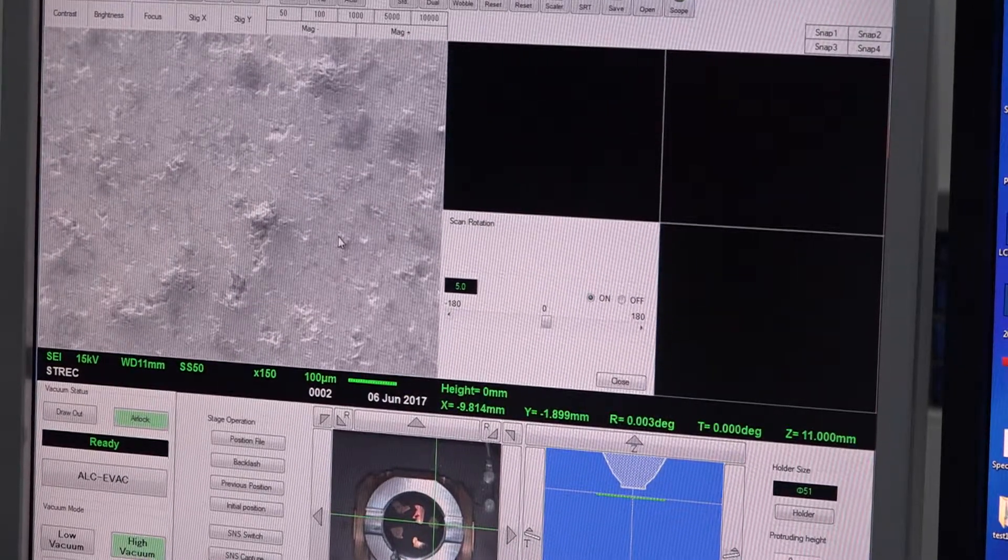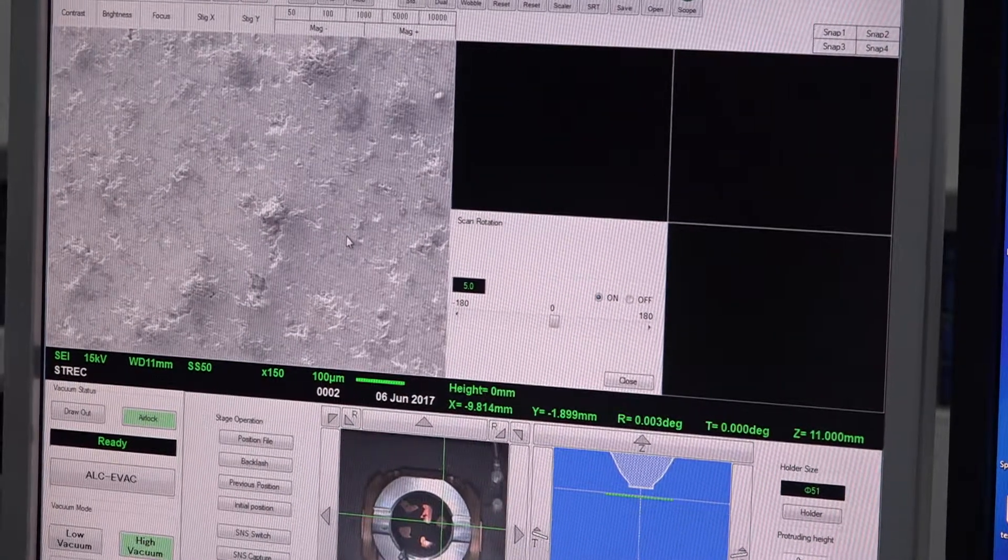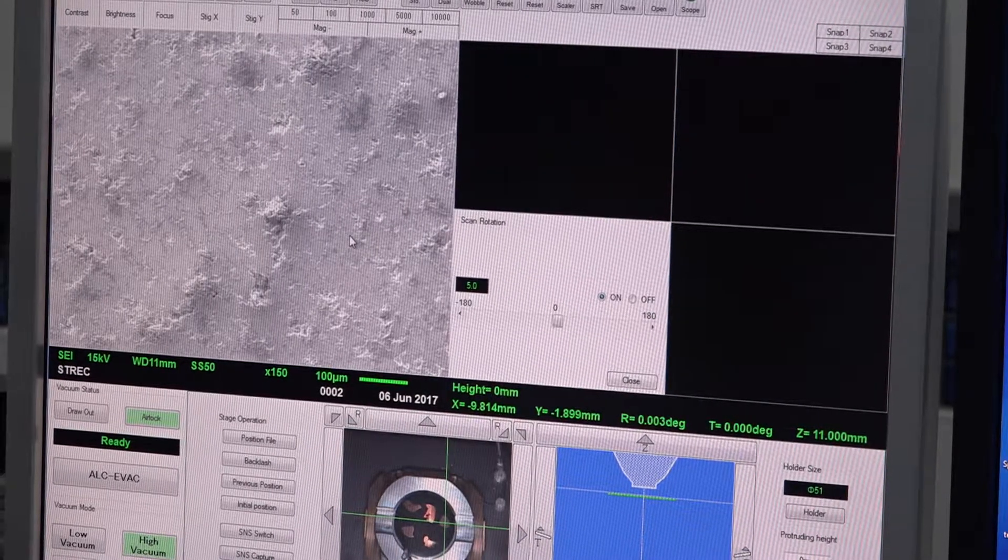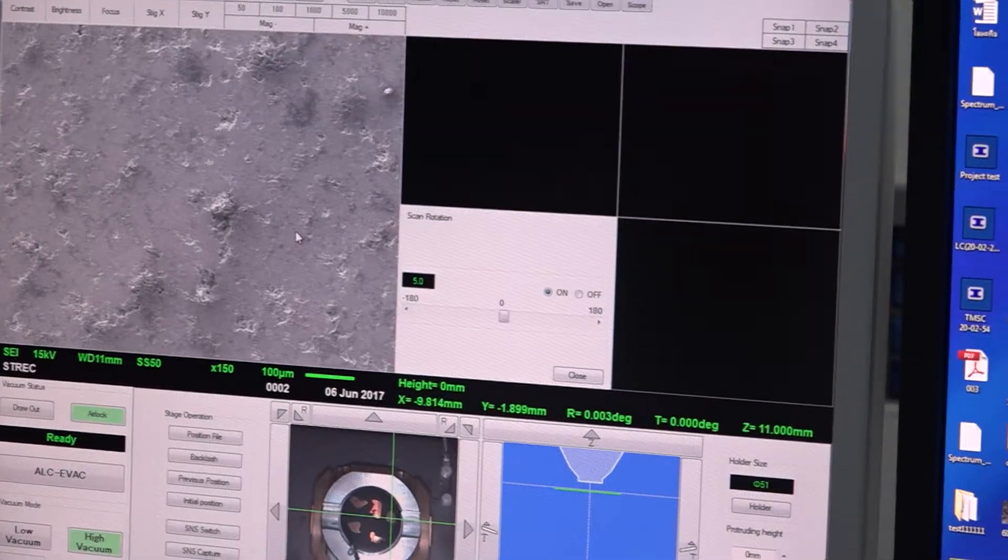The SEM operates in high vacuum, so living samples, liquids, and anything containing moisture must be dried before observation.